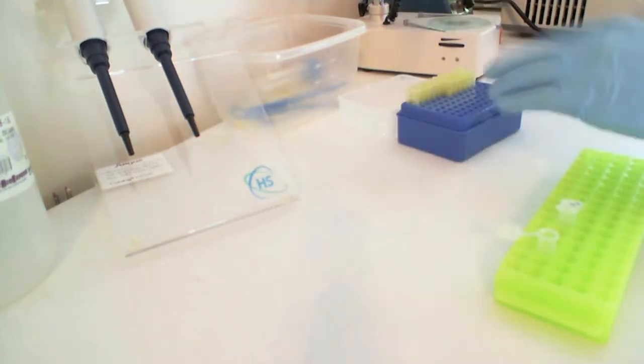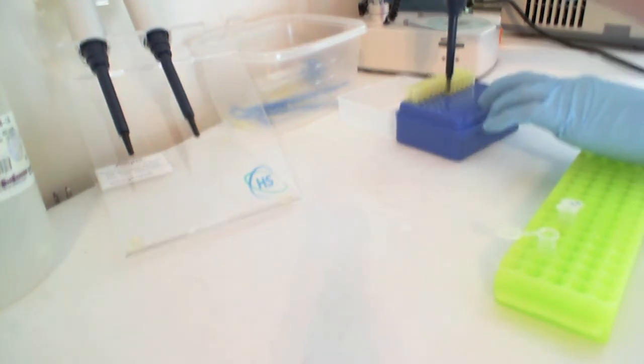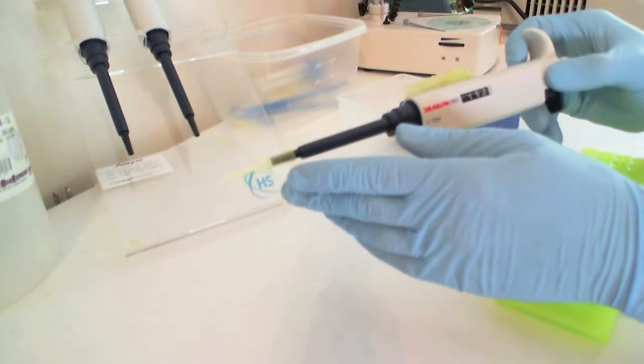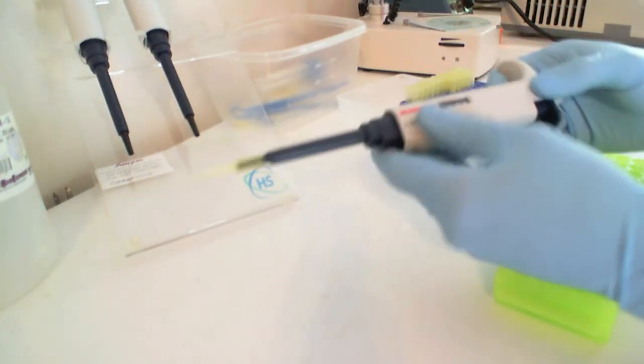They work by affixing a tip to the end of the pipette. These plastic tips are disposable and should be changed for every reagent that you use.